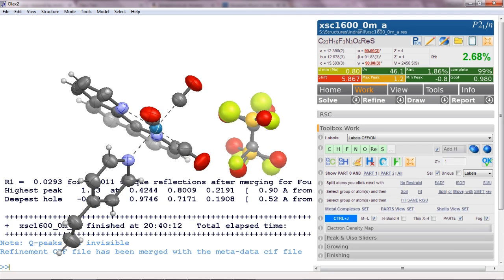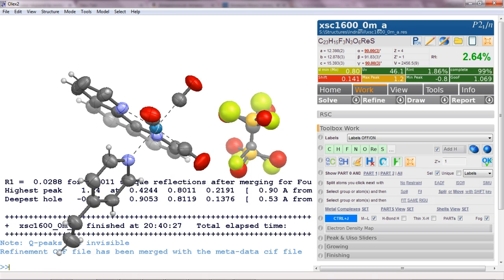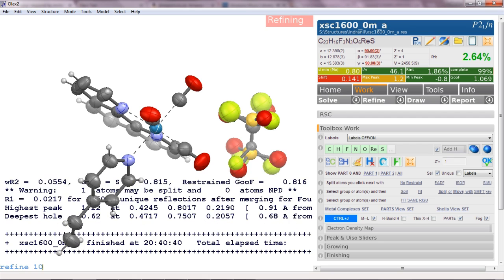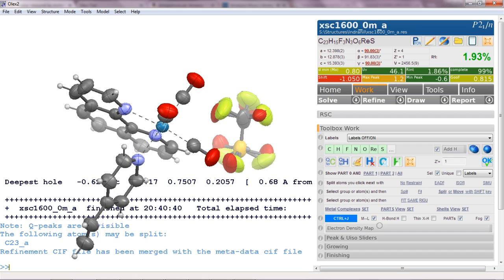And we hit control R which is the same as refining and see what happens. And that looks really rather nice. So we are still isotropic and yet the R-factor dropped to 2.68 percent. Let's do a few more cycles here to let it settle. Refine 10. And yep, that moves nicely. We got very little movement left. It's 2.6 percent still. So we make it anisotropic and refine again with 10 cycles.